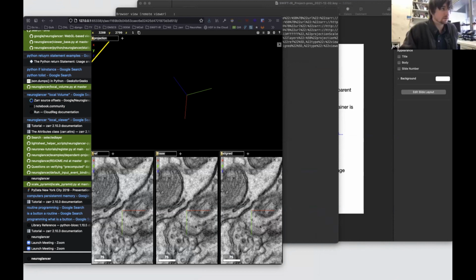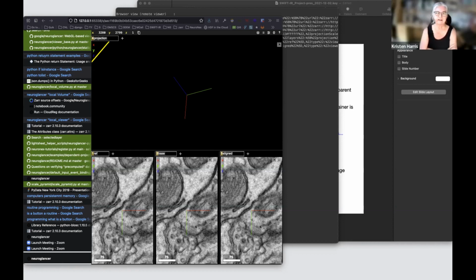Yes. So generating the scale hierarchy is actually useful for two things. It helps with the alignment itself. It's used in the process of alignment, but also it's used for viewing. So when you're zooming into an image, at a certain point you might want to just use a lower scale of the image. Or I guess it would be the other way around. You'd want a higher resolution as you zoom in.